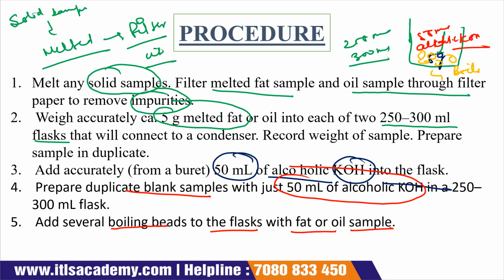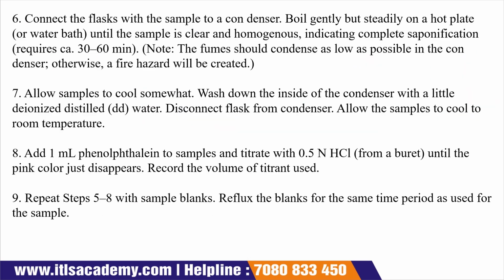Boiling beads, along with this sample. Now the next step is to connect the flask with the sample to a condenser and boil gently but steadily on a hot plate until the sample is clear and homogeneous. Now what should we do?